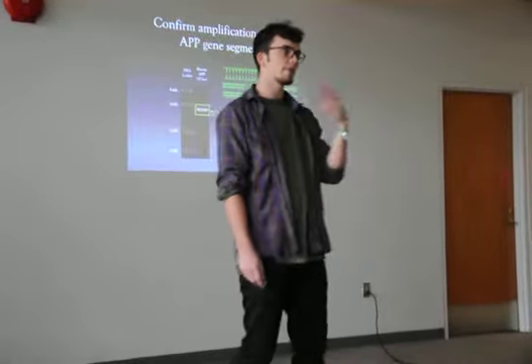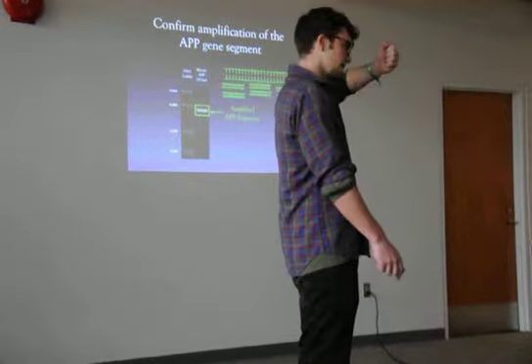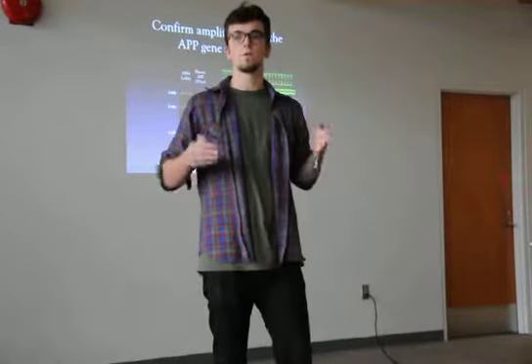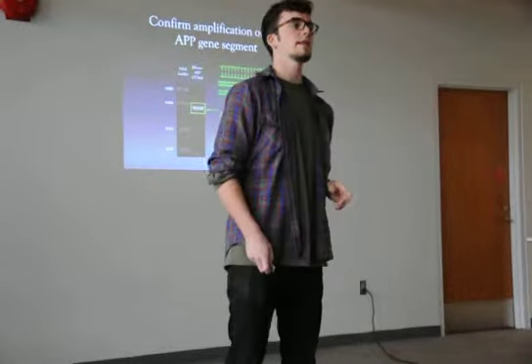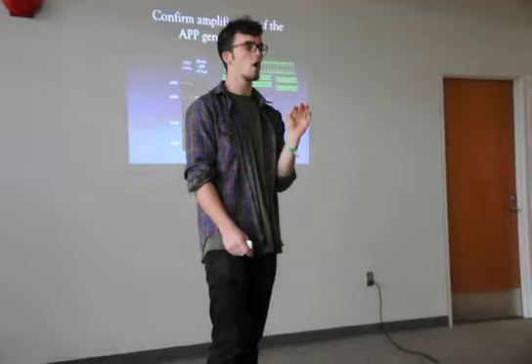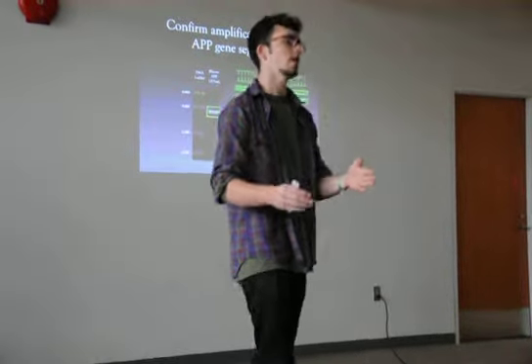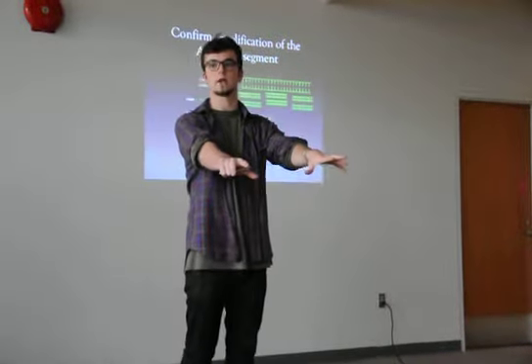So what I do is after I've made these photocopies of the gene segment, hopefully, I inject them into a gel. And this gel is a porous material. And I force these gene segments through the gel with an electrical current. Now, these gene segments are of a certain size. So smaller gene segments should force their way farther through the gel, and larger molecules will get stuck higher up in the gel as I'm pushing them through with this electrical current.